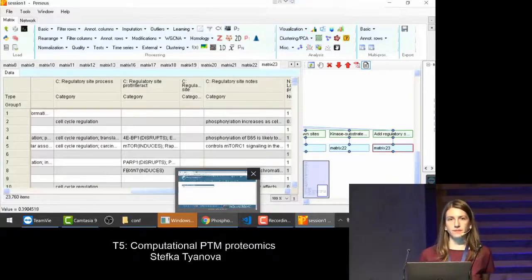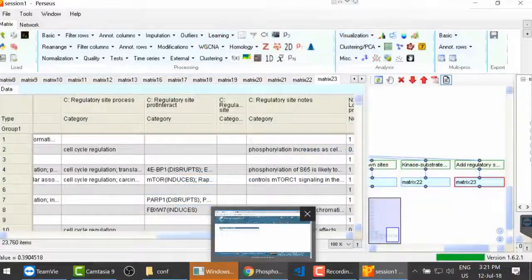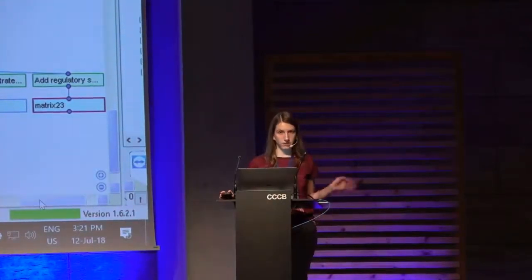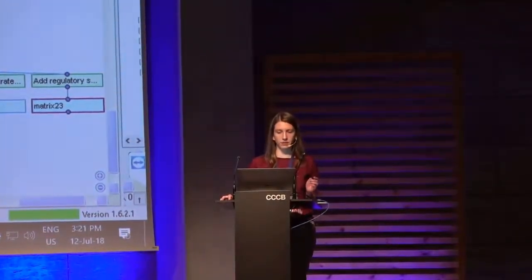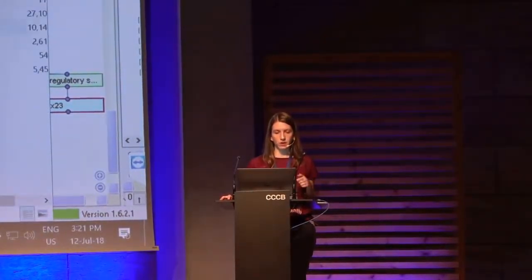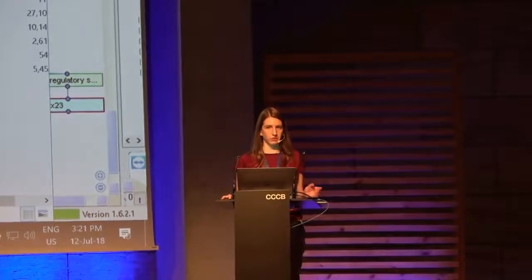Some of these modifications that you have added, like for example the known sites or the regulatory sites, can they also be put for other PTMs, like ubiquitination, for example? If it is in the phosphosite data, yes. Essentially any table that you download from PSP and you put in this folder, and you have this sequence window for the respective PTM, whatever it is, it will be matched and imported in the dataset. And you can just download the data and you don't need to change the format or anything like this.